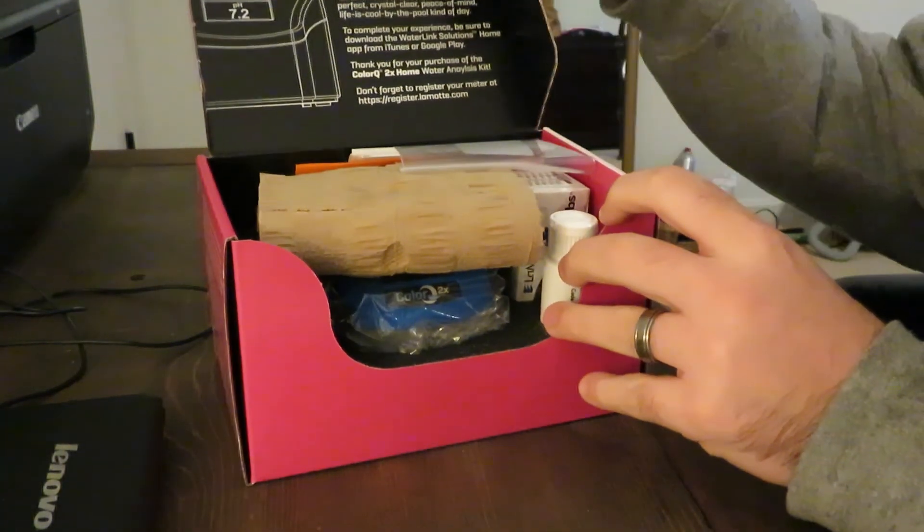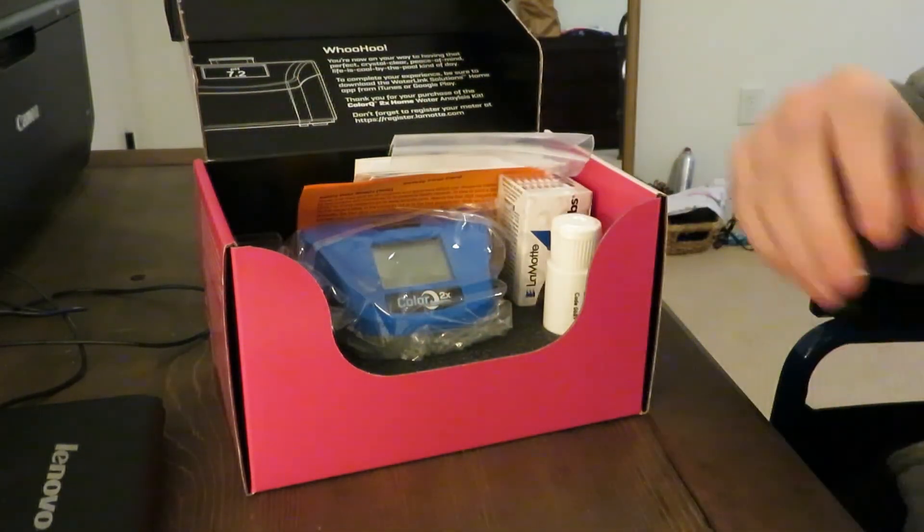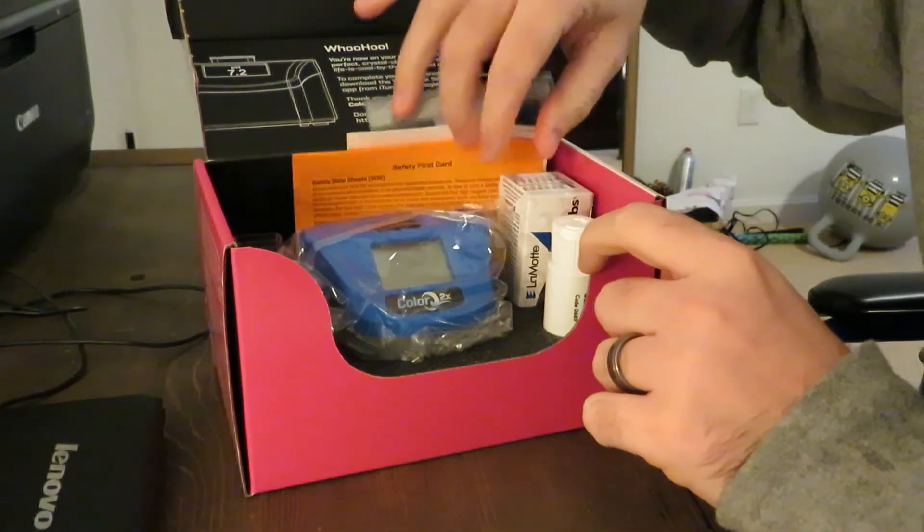Open it up. It comes neatly packed in a really nice box — keep it dry. And inside we have our tester and our reagents.